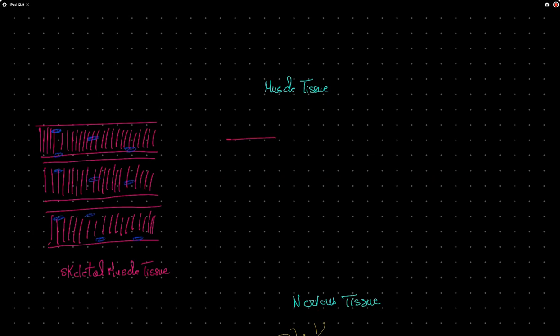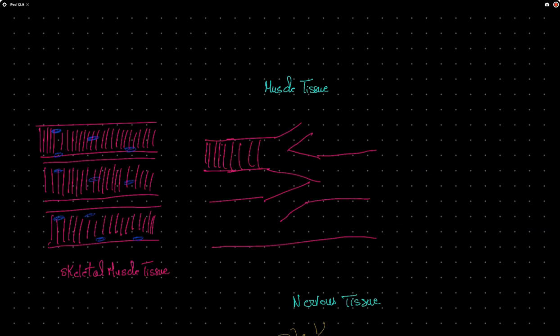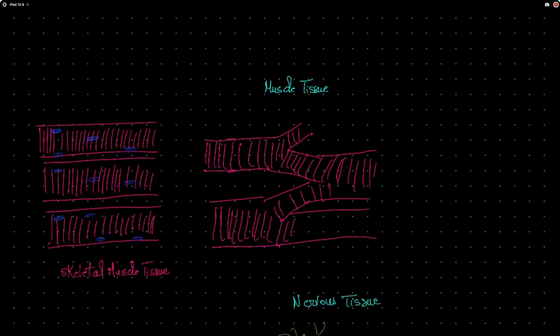Here we might have cells. How did I know that those are cells? They have clear boundaries. They might show some nuclei. In some cases, you won't see nuclei. They are cylindrical shaped cells. They are still striated. They have dark lines throughout the length of the cylinder. And I will have even darker lines connecting the adjacent muscle cells.